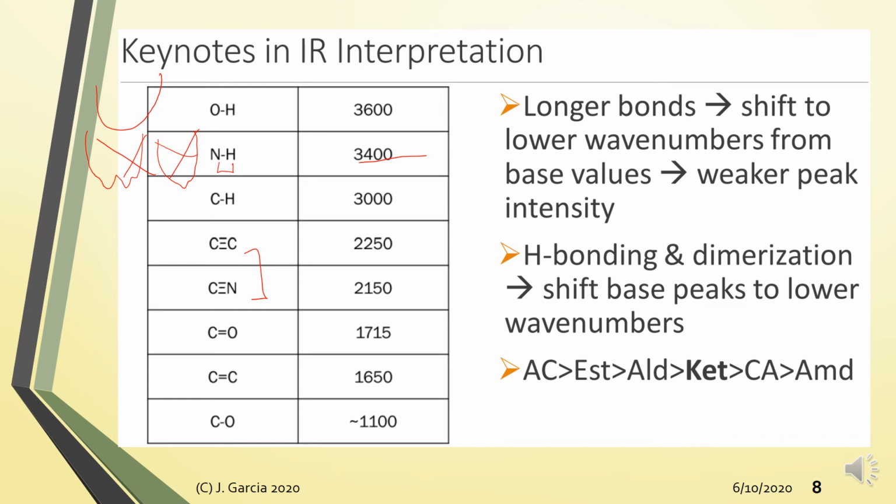What you can do here is that if you have your spectra, and both of these are weak intensity peaks, no? So, ang technique, kung may nakita kang weak intensity peak sa region na yan, you draw a line at around 2,200, no? Pag nasa kaliwa yung peak, then that is alkyne. Pag nasa kanan yung peak, that would be a nitrile.